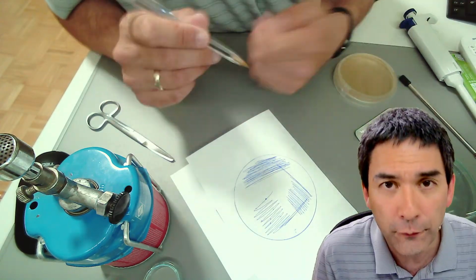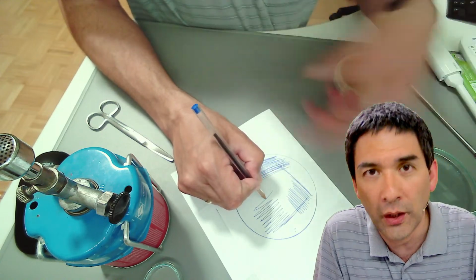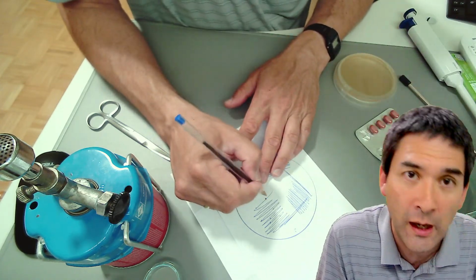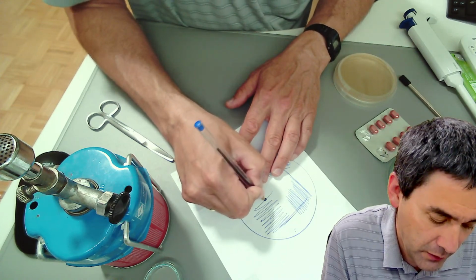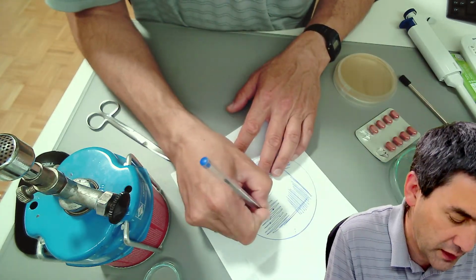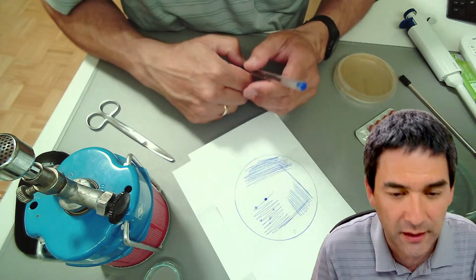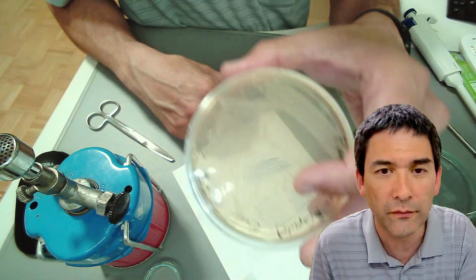But then I have to wait for 2 days, and this bacterium over here will start to divide exponentially, from 1 to 2, 4, 8, 16, it doubles to 32. You get the idea. It grows exponentially, and after about 24 or 48 hours, I'm able to see with the plain eyes a colony over here, and over here, and over here, and over here. So this is the thing that I would like to see at the end.